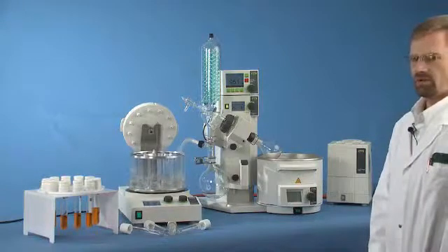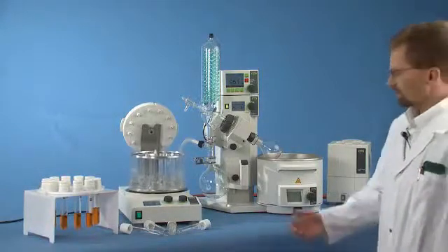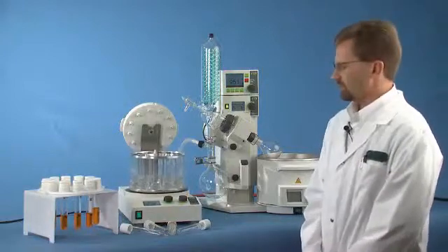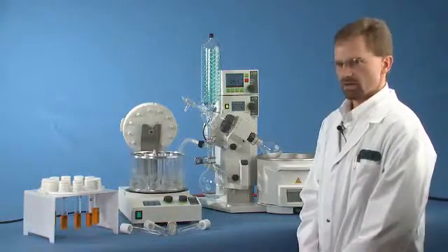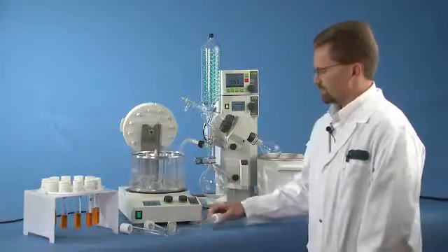Another key feature of the Multivapor is that it adapts to your workflow. We have several adapters that allow you to utilize different vessels for your parallel evaporation requirements.